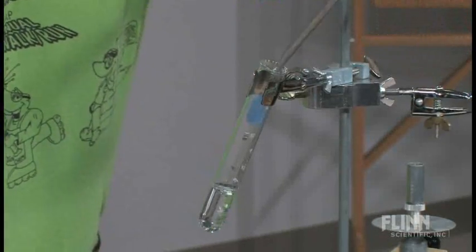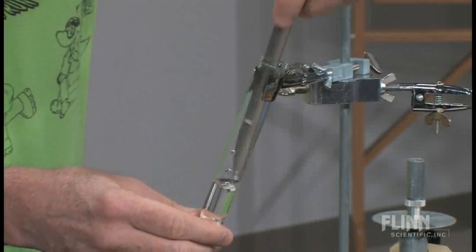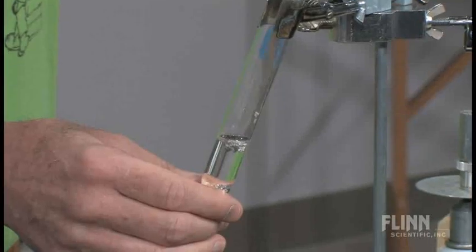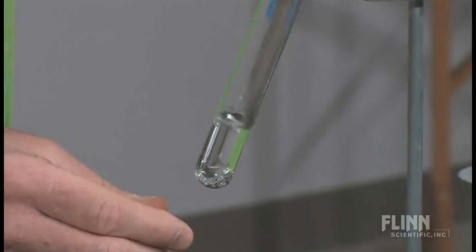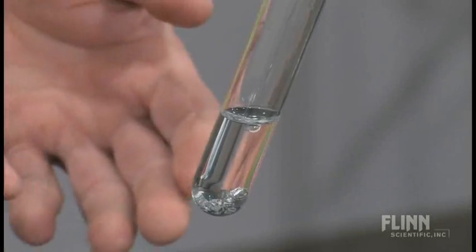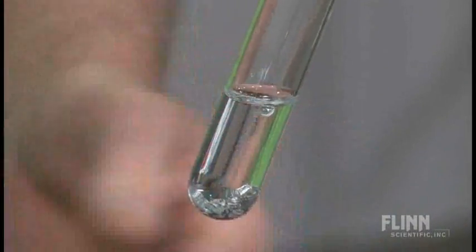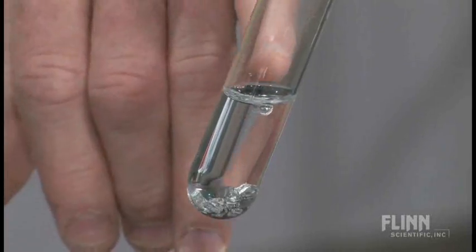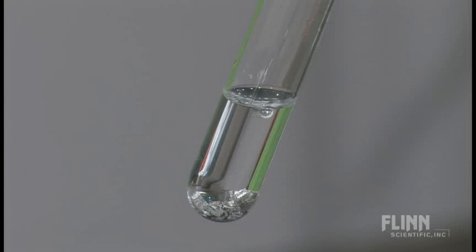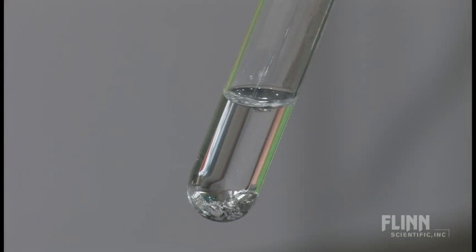So I'll do that. Get these guys to slide down. These that are floating on top, I'll set on the bottom. Already we've seen something really kind of interesting. Magnesium is more dense than water. It's sunk to the bottom. We also see a little surface tension phenomena because I've got one piece that's sitting on top still. So we'll push that one down too to get it at the bottom. That in itself is kind of cool. Now I'm going to heat this.